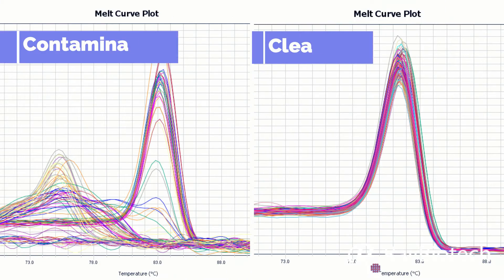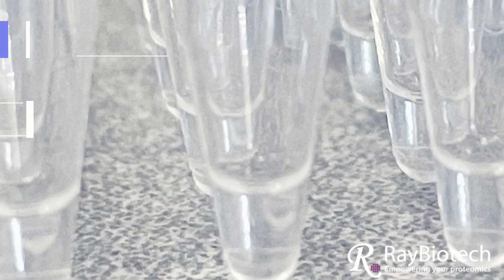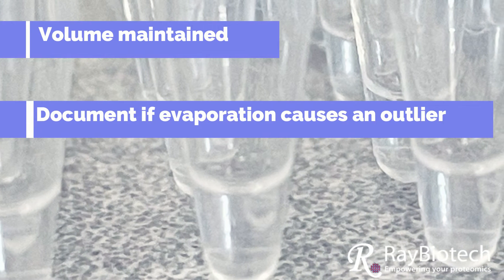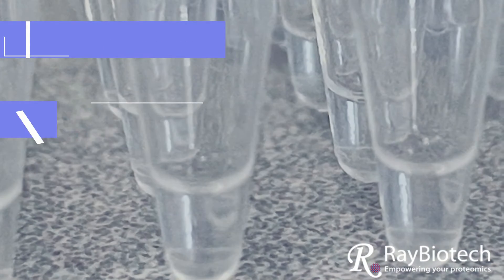Following the experiment, check the melt curve for indication of contamination, the wells for potential evaporation, and the seal for any potential issues. If any are noted, you can document them in your output to see if errors in plate sealing caused an experimental outlier.